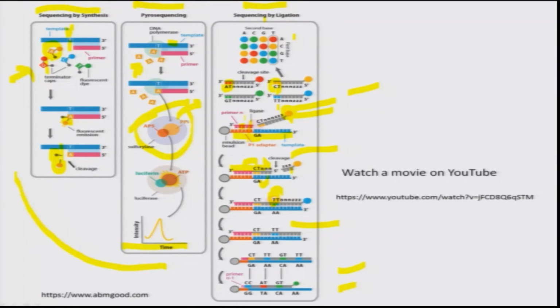If you consider the primer ends at 0, then it anneals at 1. You could have other sequences annealing at -1 or -2 or +1 or +2. Therefore, you are able to read the entire segment and get the sequence. This is another method which is not very successful, but these are the two most common chemistries people use for next generation sequencing.